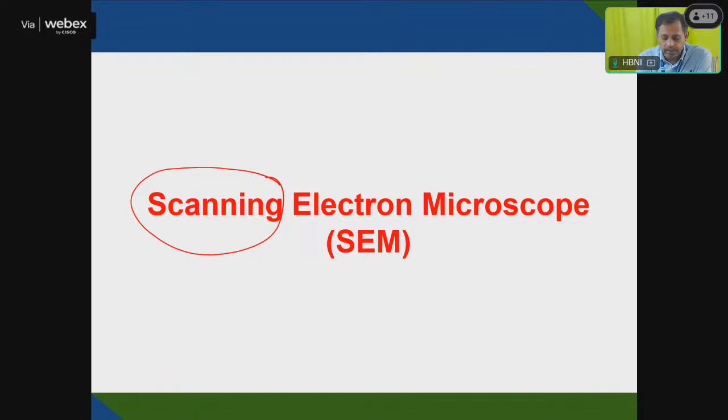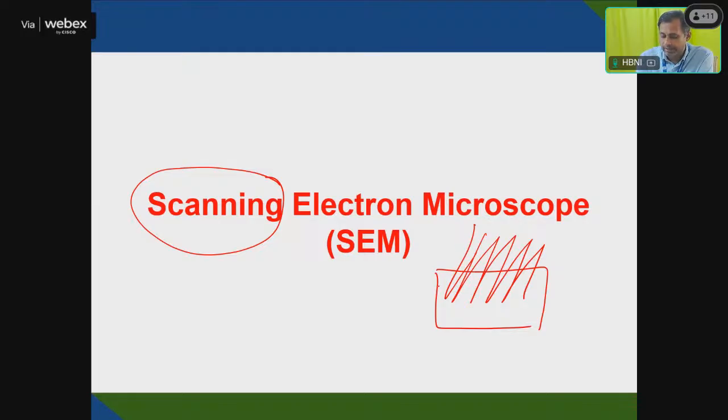That means in the electron microscope, we have a raster scanner. If you have a sample like this, the scanner scans the surface from one X and Y position to the next. So it gives a whole image. And how will it scan? That will display the whole image.